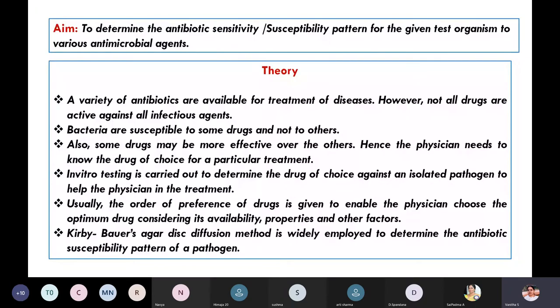For this experiment, what is the aim? To determine the antibiotic sensitivity or susceptibility pattern for a given test organism to various antimicrobial agents.